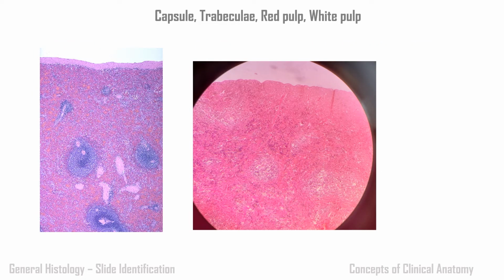Then the last lymphatic tissue. Here we can see this. This is a bit faded slide. I have used a medium quality slide so that you can identify the tissue even if the slides are a bit faded.